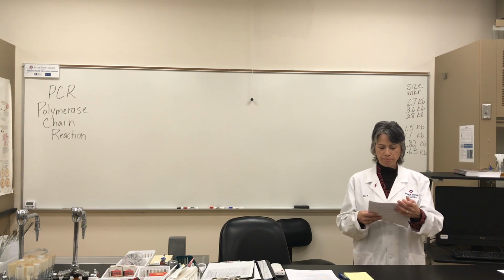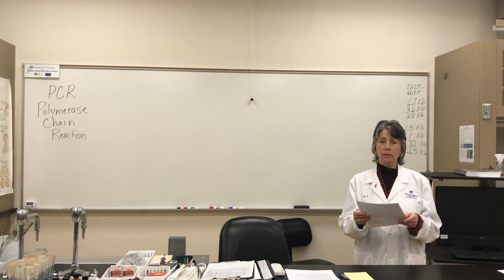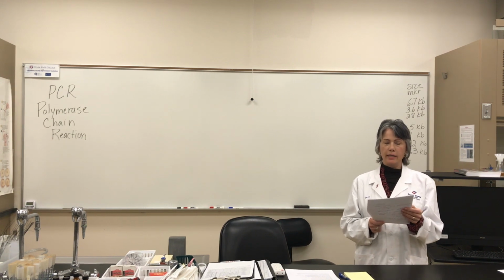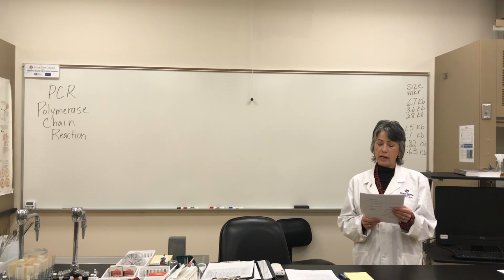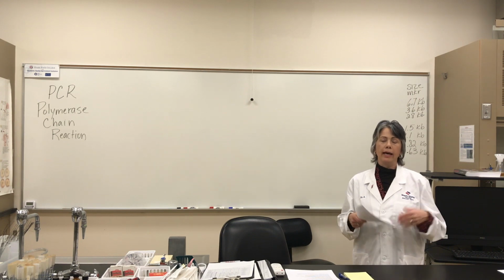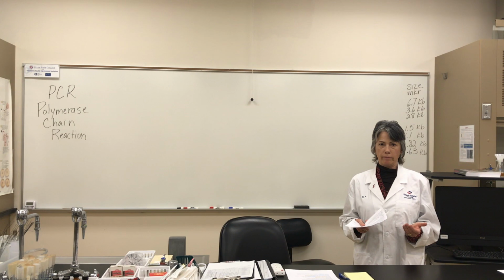Okay, we've set up a story for this experiment to make it so much more relevant for you, and I want to review that with you. So in the scenario we've created, the simulation if you will, there has been an outbreak in a hospital of a particularly nasty strain of E. coli. Remember, everyday E. coli, normal flora found in the colon.